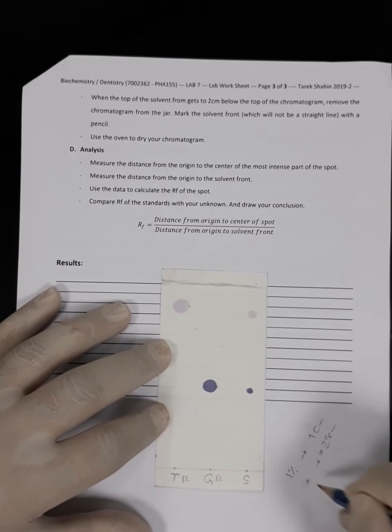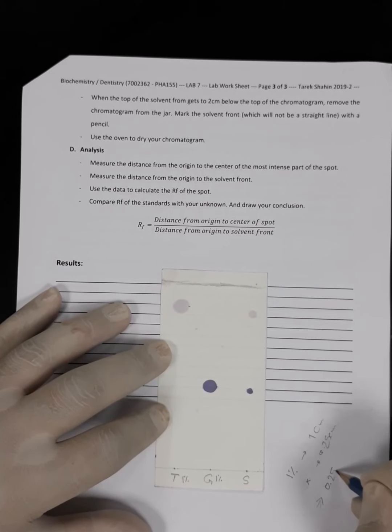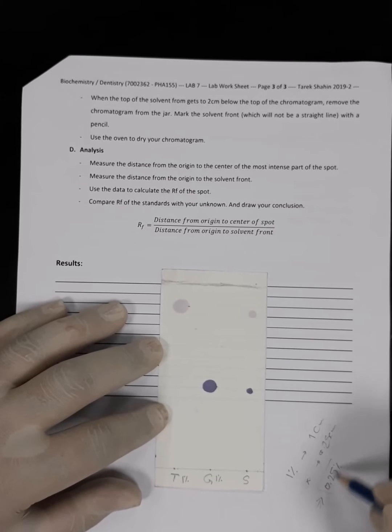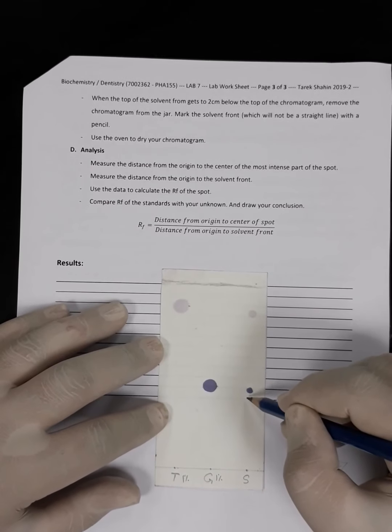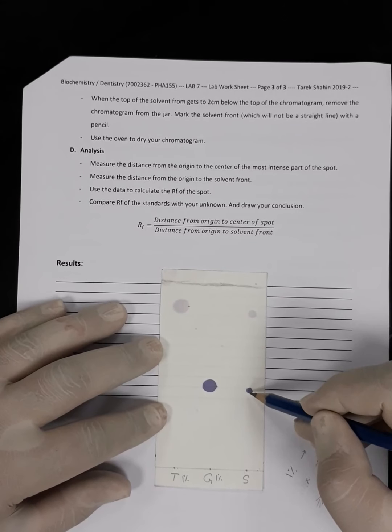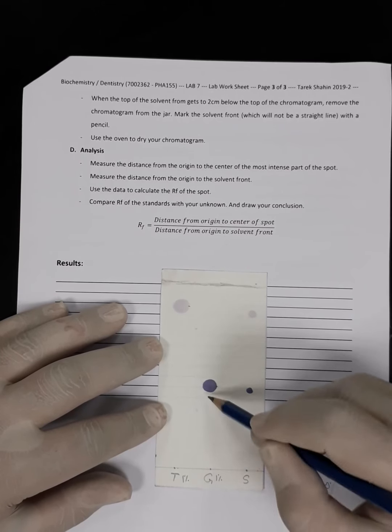So what would be the concentration? By cross multiplication, we will find out the concentration is 0.25%. Of course, this is not a very accurate way to get the concentration, but we can get a relative concentration. We can say that the content of glycine inside the sample has a much lower concentration than 1%, because we are going to compare it with the standard glycine.